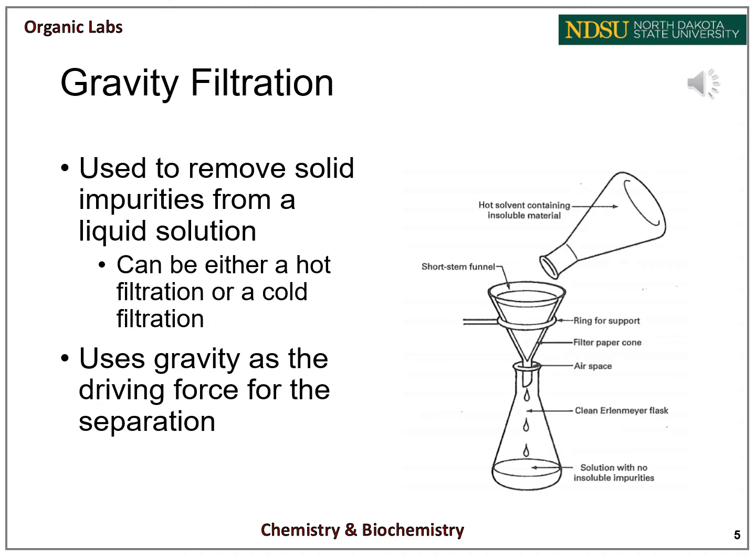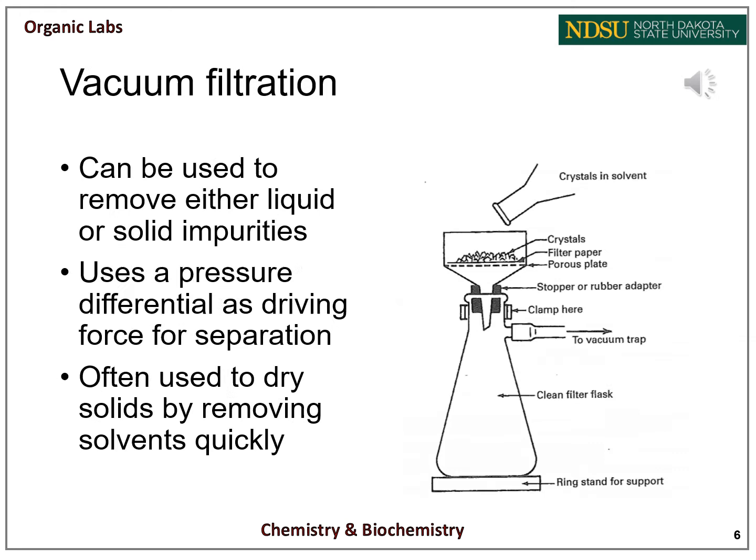We use this piece of filter paper in the gravity filtration to separate the solvent from impurities that we don't want, just like how coffee pots use their coffee filters to prevent the ground coffee beans from getting into your coffee. The other filtration method is vacuum filtration.